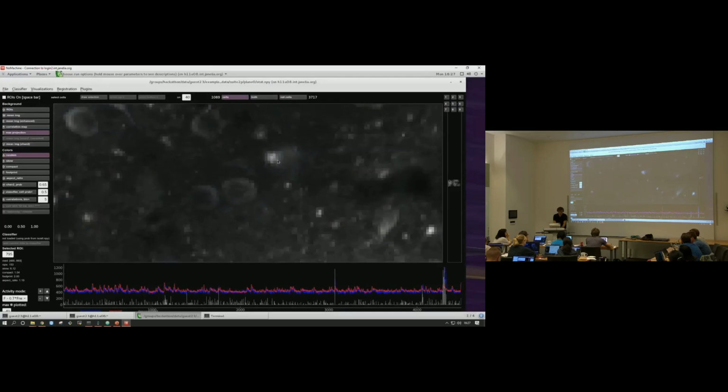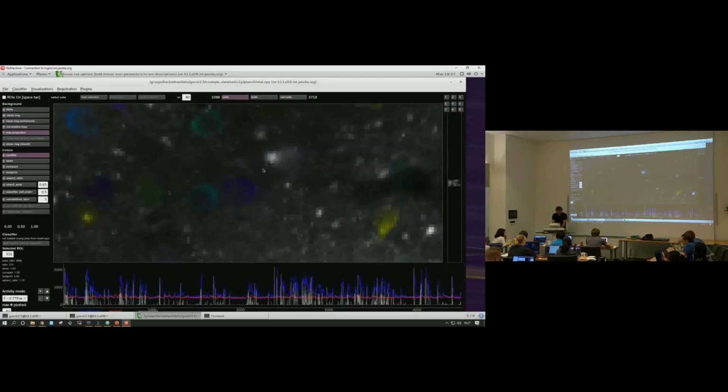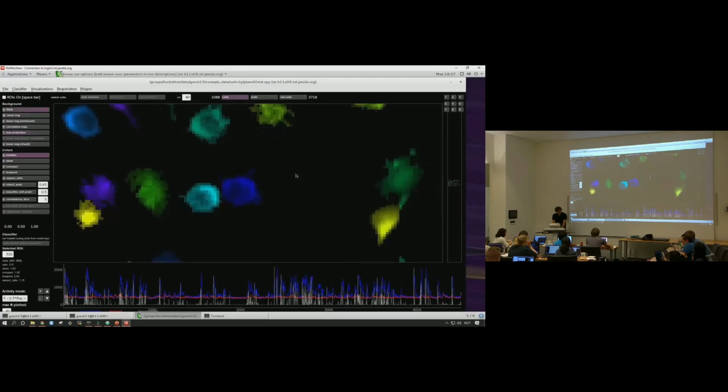Now, it looks too big to me to be an apical dendrite. So I believe there's a cell sitting a little bit below the imaging plane, and maybe this is the region of its apical dendrite. So maybe it's not cut quite well, I don't know. But in any case, if this went through with the analysis, it would not be the end of the world. But now that we've looked at it, you might as well reject it if you want to be conservative.